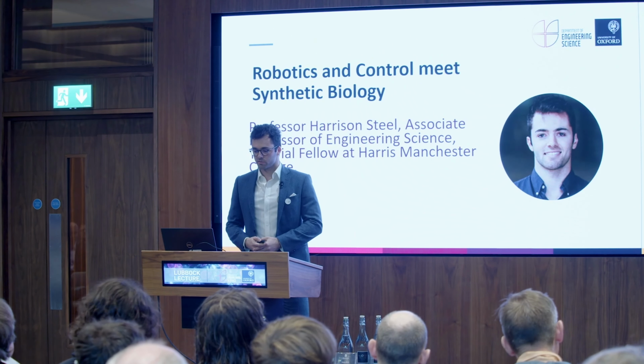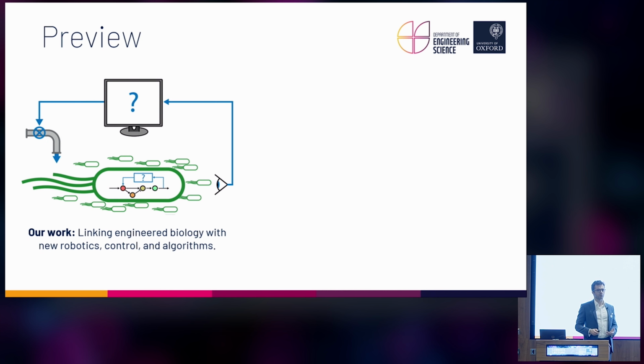So for my talk today, our research group, I just want to give an idea of what we do. In practice, we have a group, half the people working on wet lab synthetic biology, the idea being here we're engineering new functions into living cells. And the other half is working in control, algorithms, robotics, here in this picture, kind of wrapping around cells to think of new ways of doing experiments, new ways of engineering cells. And so today I'm going to talk through just one specific area we're working in under this broad philosophy.